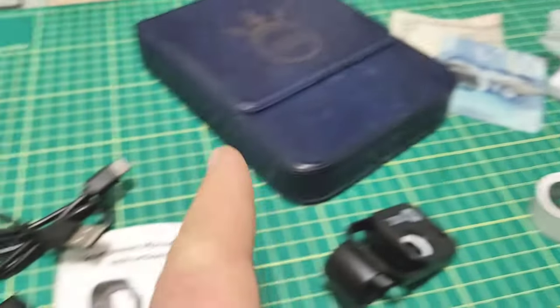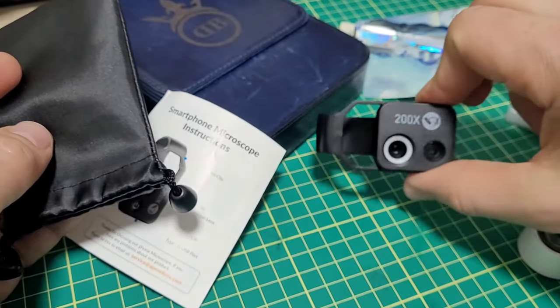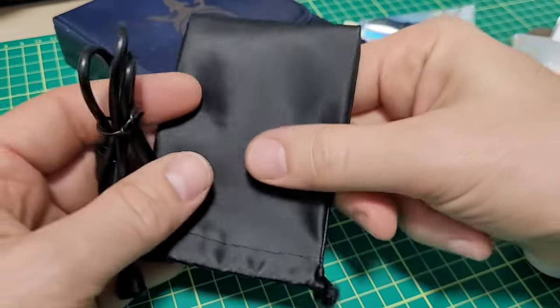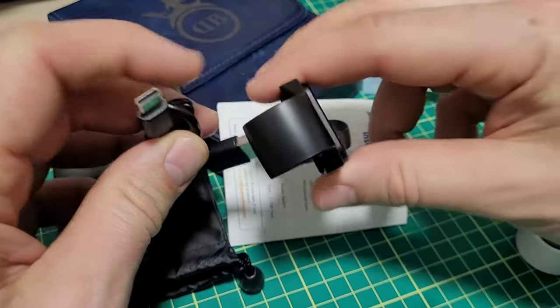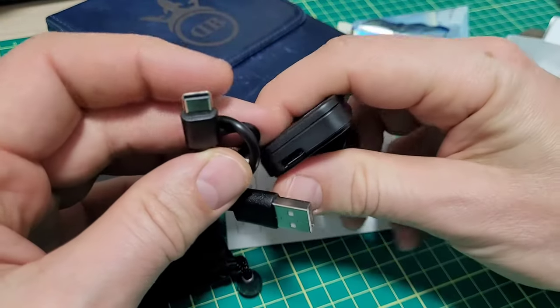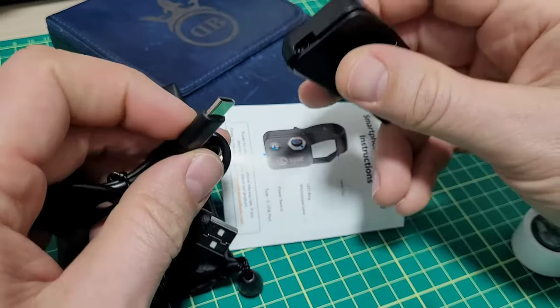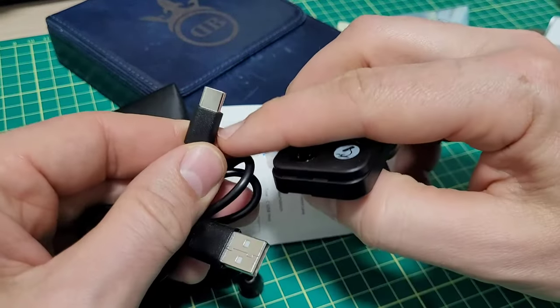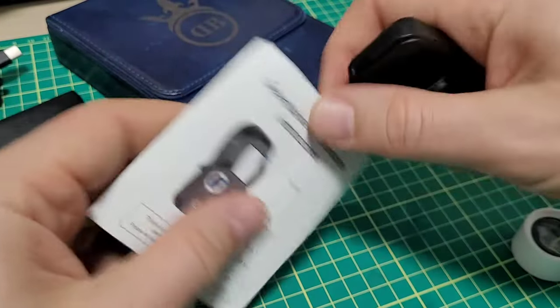It comes in this handy little pouch to keep everything safe. Obviously the clip-on microscope is there, instructions, and a little USB Type-C cable — that's how this thing charges. Just a note: I tried to plug in my Type-C cable that charges this exact phone I'm running the channel on, and I guess the housing on mine was a little bit too big. This one here fits in perfectly, so don't throw it out because maybe your cable doesn't work.